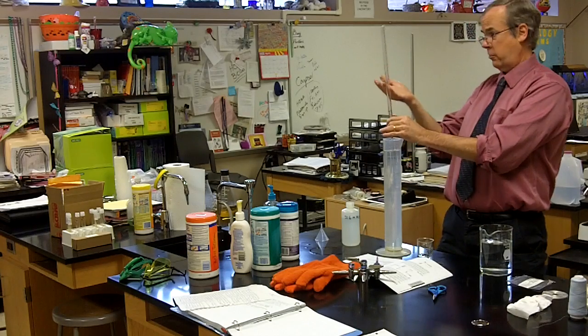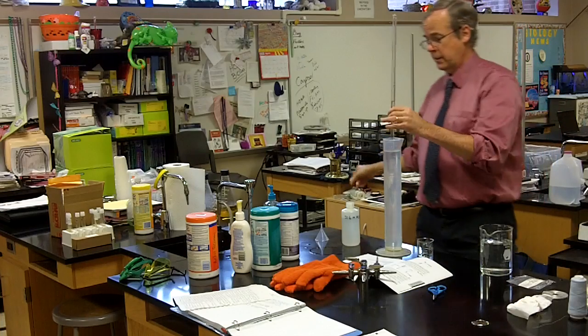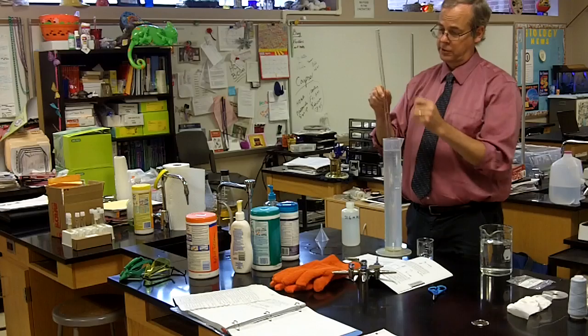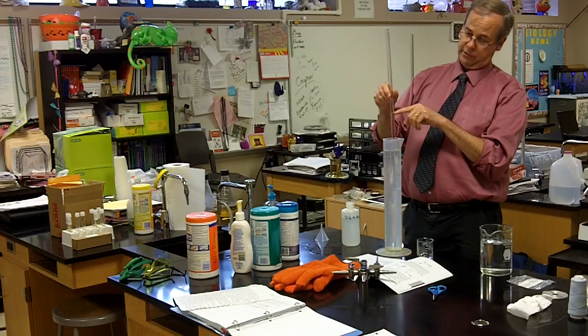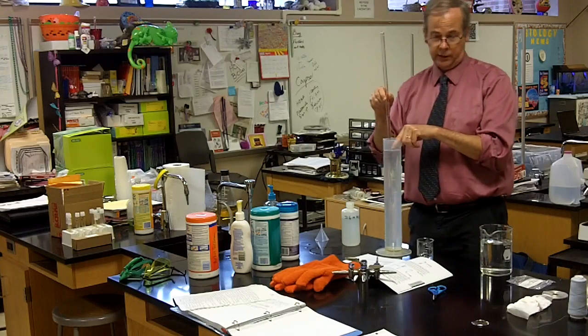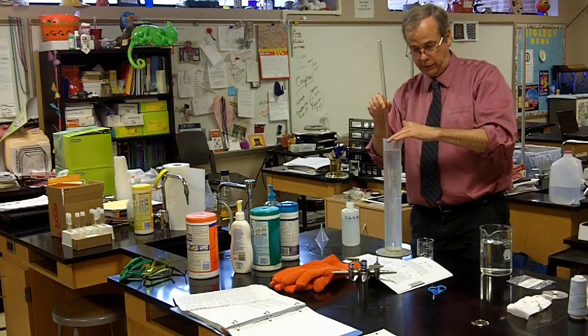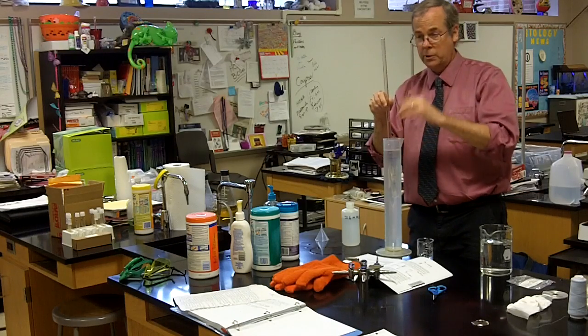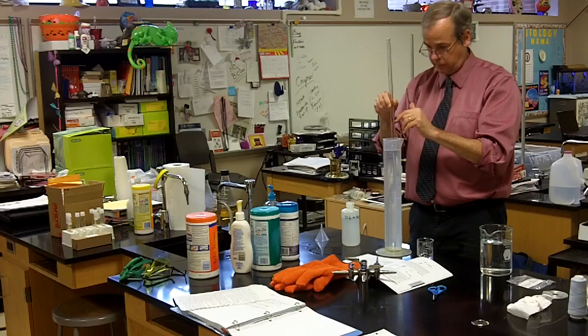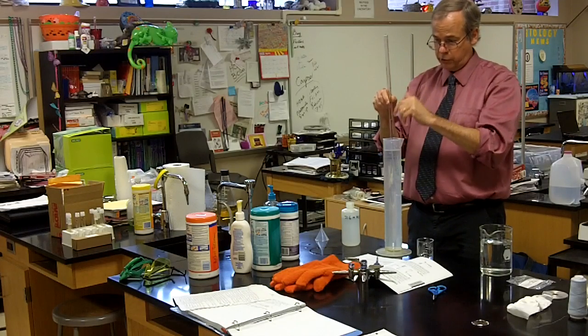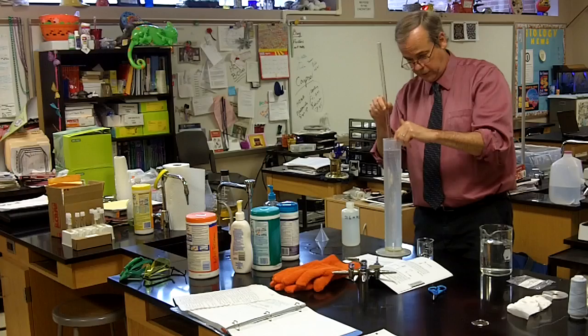Now, you may be saying, how do I know the pressure of that gas in there? Well, if we know the pressure of the room, we can determine the pressure of the gas in the tube. Currently, the level of water in the tube is higher than the level of water outside the tube. The atmosphere is pushing down on the water outside the tube. The gas is pressing down on the water inside the tube. And the gas inside the tube isn't pushing as hard as the gas outside the tube. That's because the level of water is higher inside than out. It's a tug of war between the atmosphere and the gas we've collected.